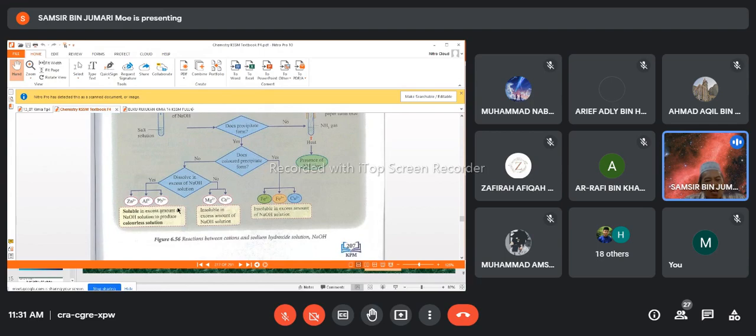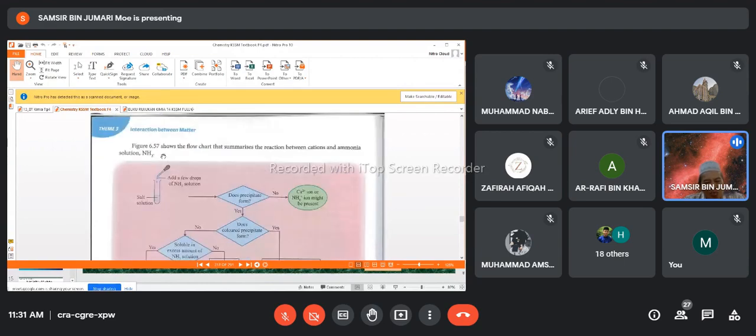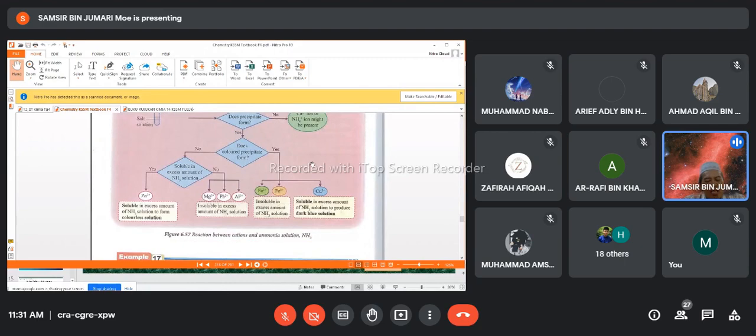Okay, yang larut. Okay, tapi daripada tiga sini kita nak pastikan satu-satu itu melalui ujian ammonia aqueous solution, iaitu dengan ujian ammonia aqueous solution, kalau the zinc ion present in that solution, the observation is the white precipitate will be formed and soluble or dissolved in excess ammonia aqueous solution.